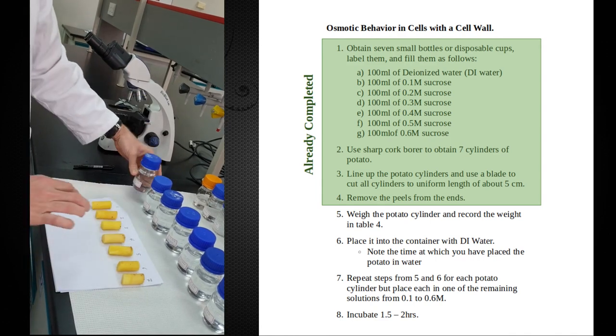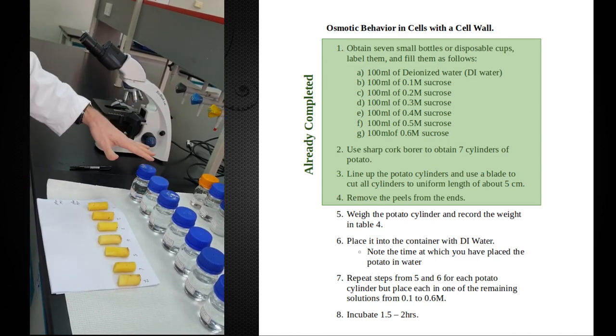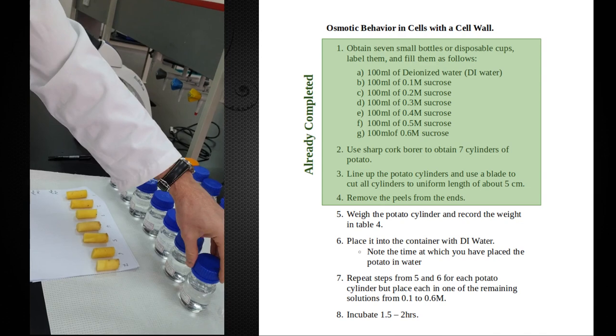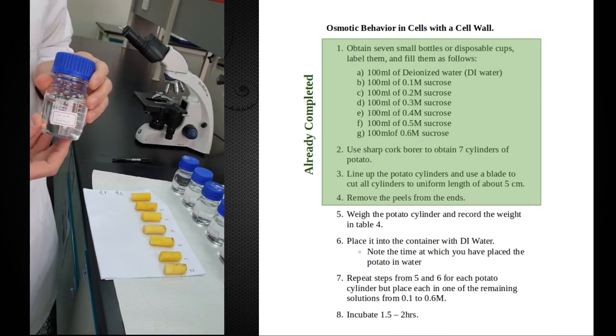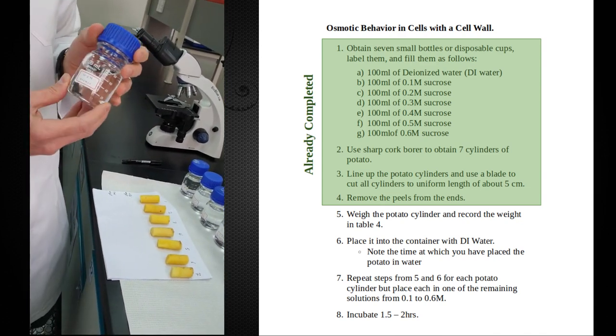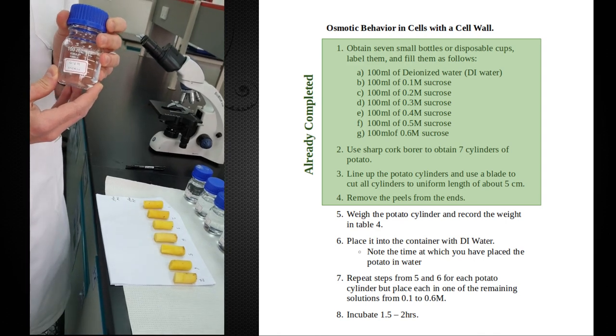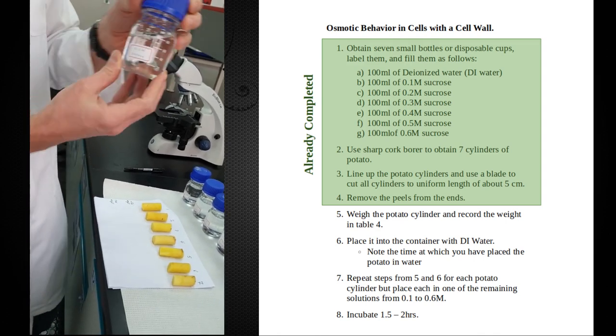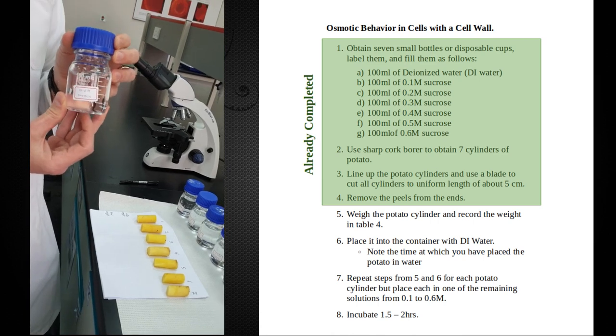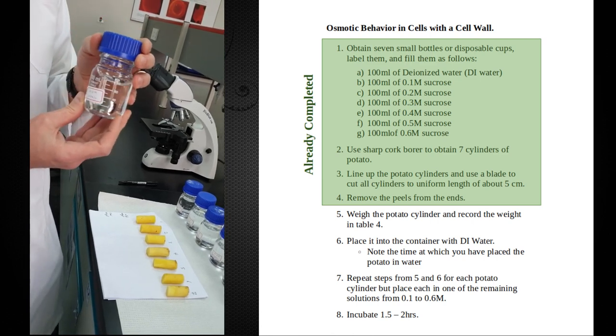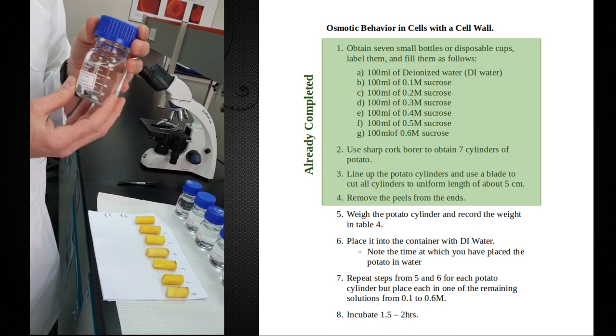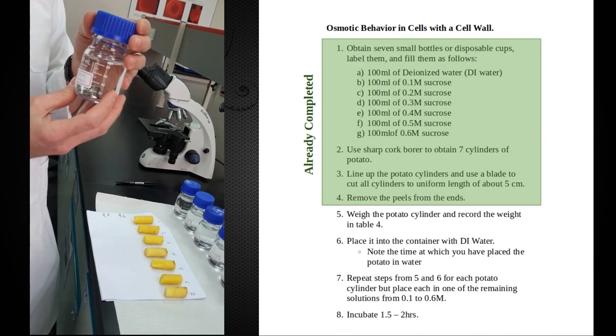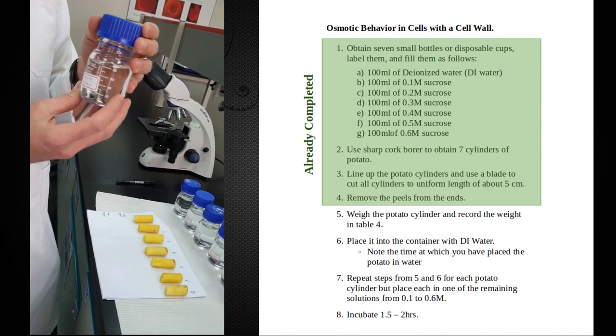So one of the potato pieces is going to go into the water. Now, we have a whole range here, and so at the end of this range, we have 0.6 molar solution, which is a fairly high concentration. And so when you put a potato into this, the solution in here is going to be hypertonic, so it's going to be much more concentrated than it is inside the potato cell.